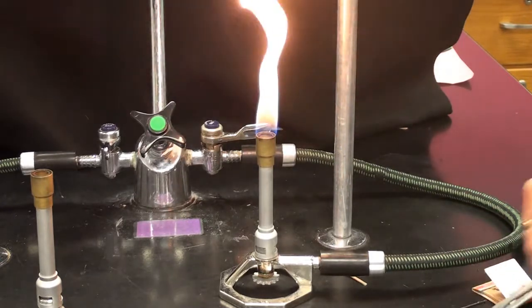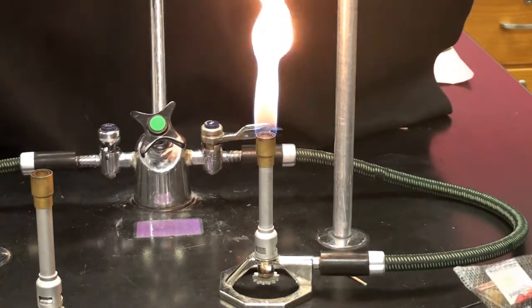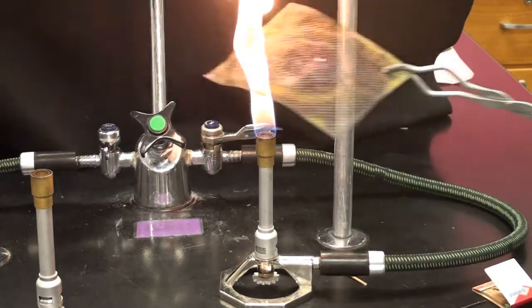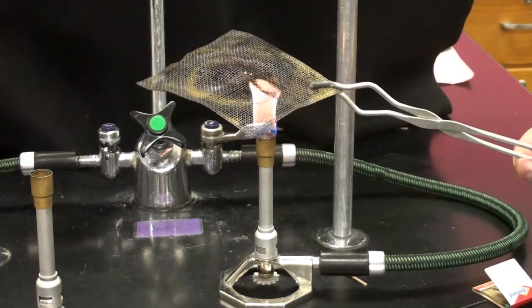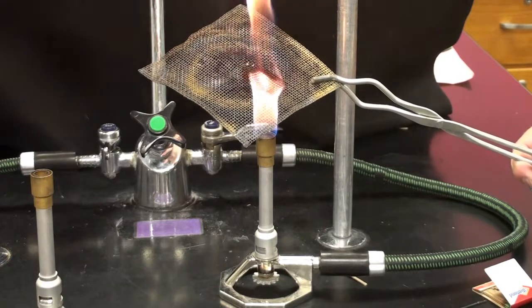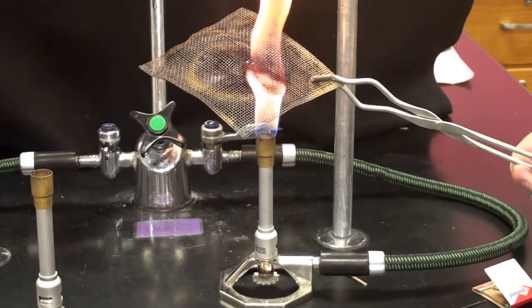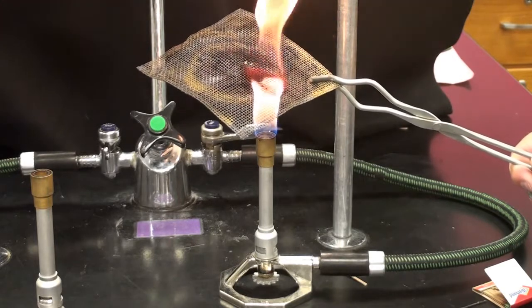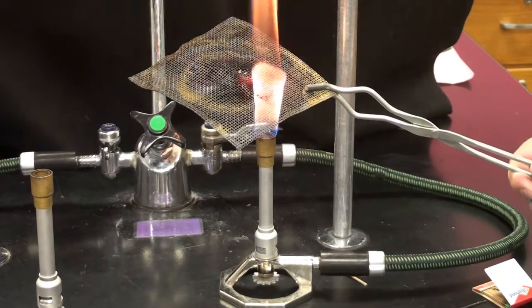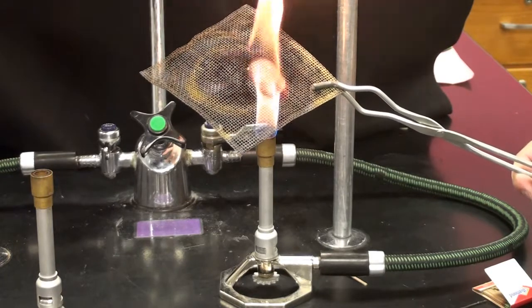Let's try something else. I'm going to take this wire mesh. This one might be a little easier to see. Okay, and I'm going to put this over it and see if it does anything for us. I'm not really seeing much difference in the wire. It looks like there's a faint glow on it. When I move it away, I can see a faint glow. I'm not sure that you could see it.